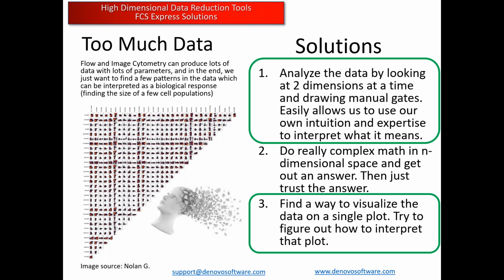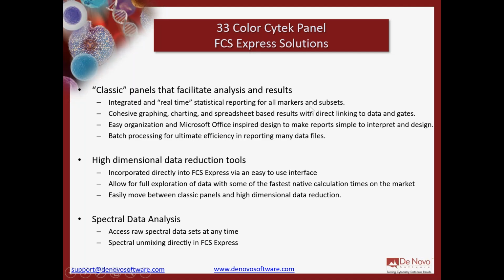And I think it's something you heard from Diana in the beginning, you heard from Chris a little bit as well, that you can use these in conjunction. You don't have to use just one or the other. You can use classical panel design, you can use high dimensional data reduction tools, and both of those being pulled together are going to give you a better understanding of what's going on with your data.